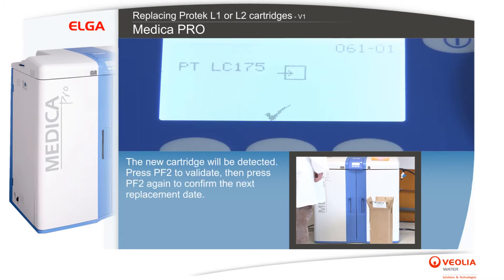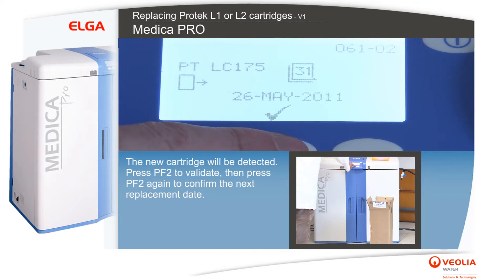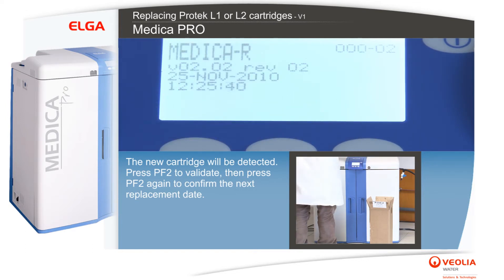The new cartridge will be detected. Press PF2 to validate, then press PF2 again to confirm the next replacement date.